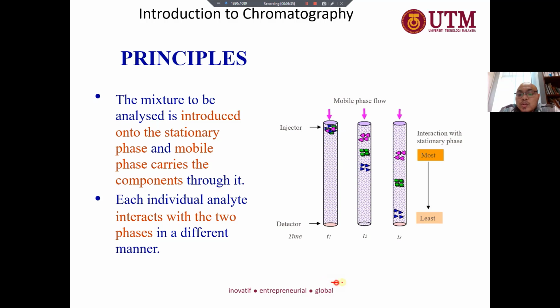If we draw the chromatogram over here, we can have the three peaks. Here is the blue one, because the component has the least interaction with the packing material. It loves the mobile phase the most. The green one is the intermediate one, and the purple one is the last one that will be eluted, because we have the detector, right?